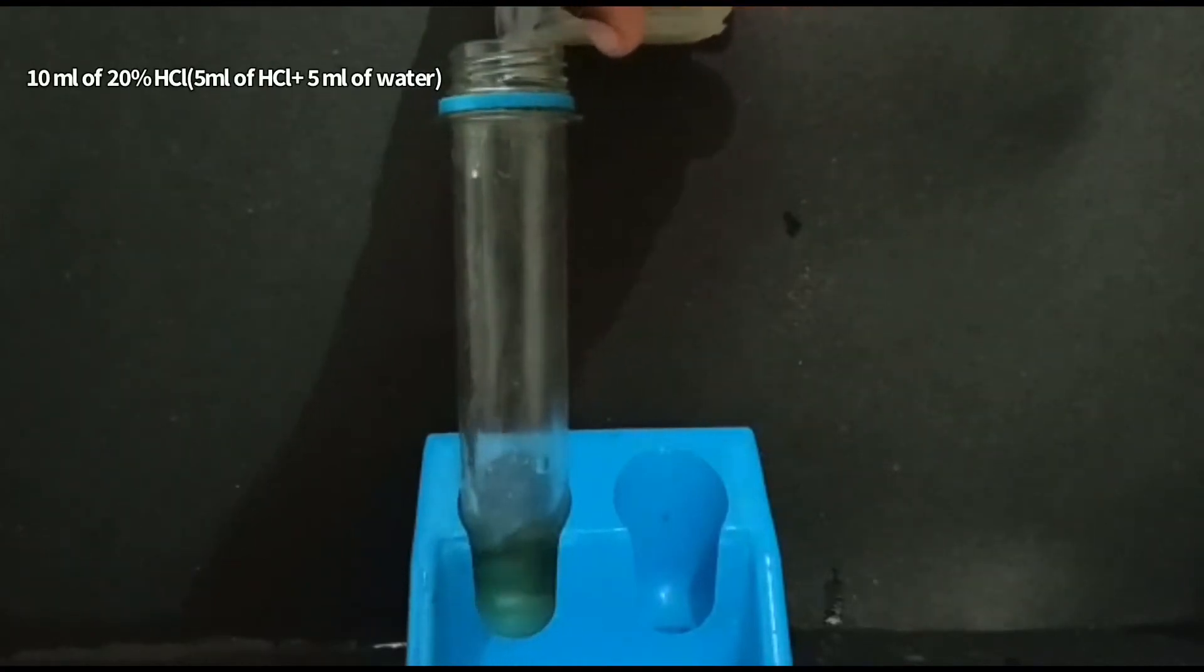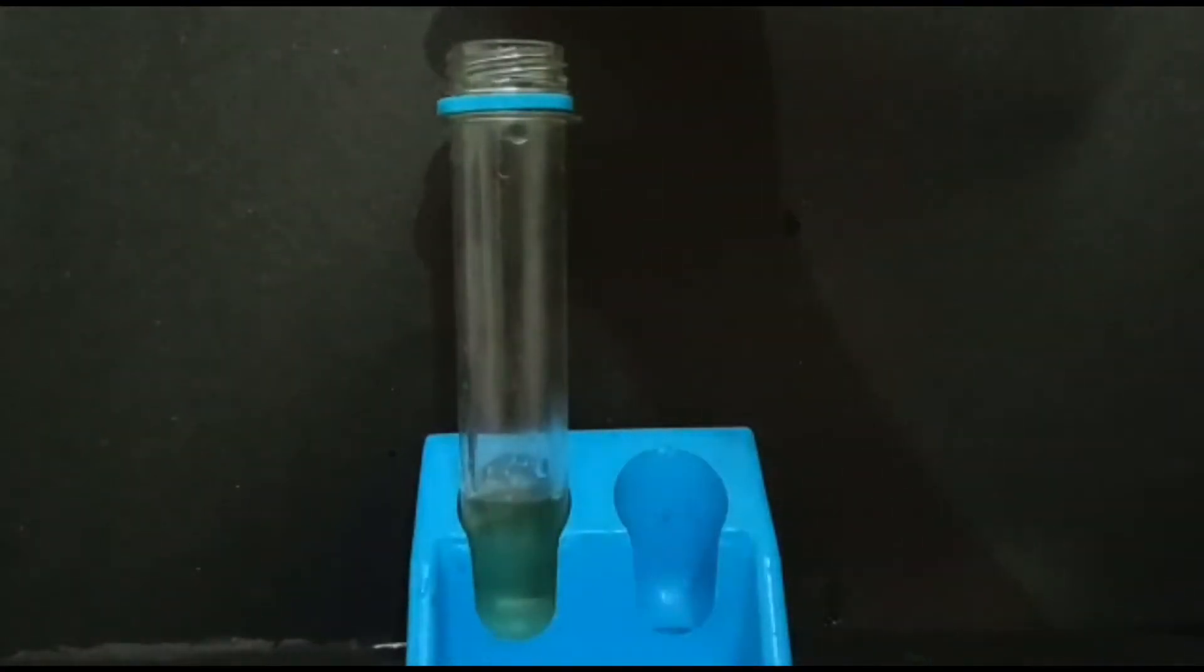To a test tube add 10 ml of dilute 20% hydrochloric acid. After the acid is added, add 2 grams of iron.